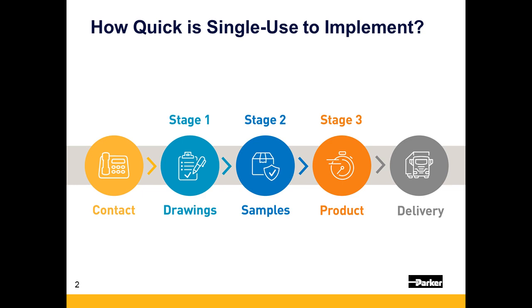These drawings would then be reviewed at least once by the end user, and in some situations there may be multiple revisions. So already the process may be into several weeks. Once the drawings are approved, the end user may require a sample for form, fit and function. And they may require the compliance data available for each individual component part, which, while it may be available, getting it is not always easy, and the data available may only be on non-irradiated components. Again, time is all adding up.